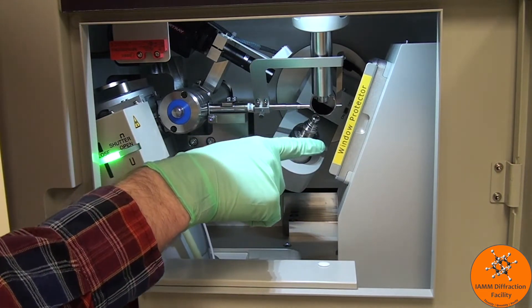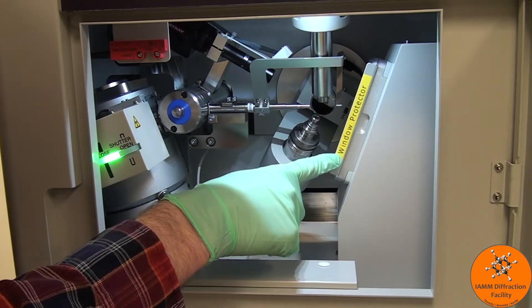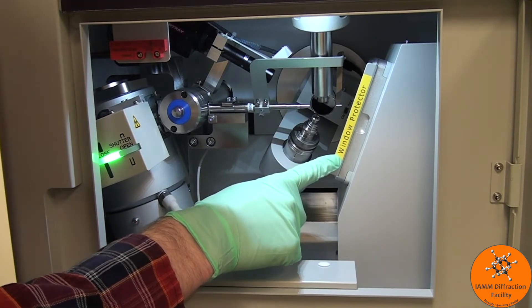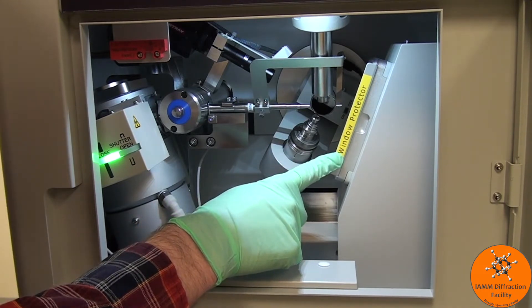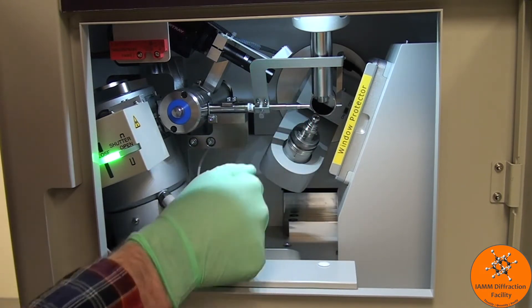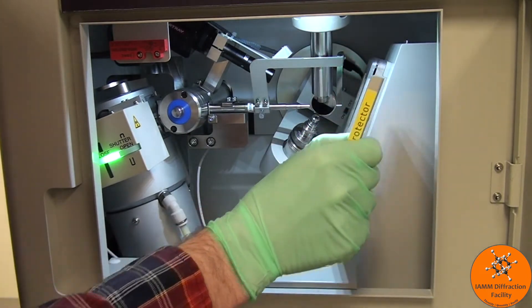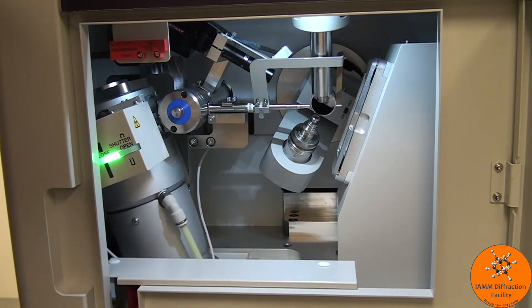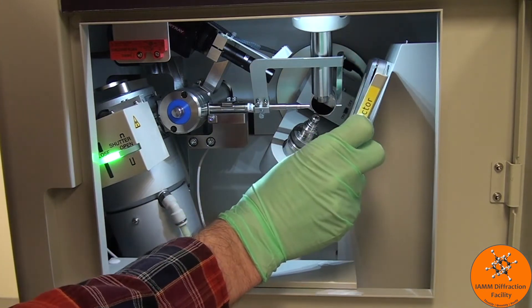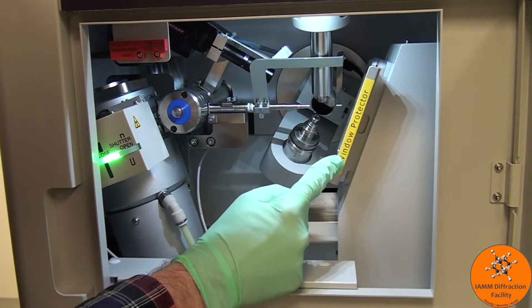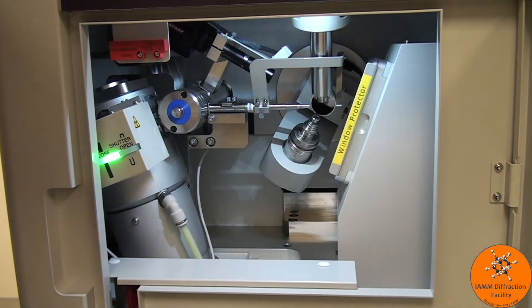This is the detector, and we see that we have a window protector. We always want to make sure that this is installed while we are in here working with the sample. In order to remove it, just slide it straight back once you are ready to perform your measurement. If you need to insert it, it should glide nice and smoothly. I will leave that installed so that I can mount and align the crystal.